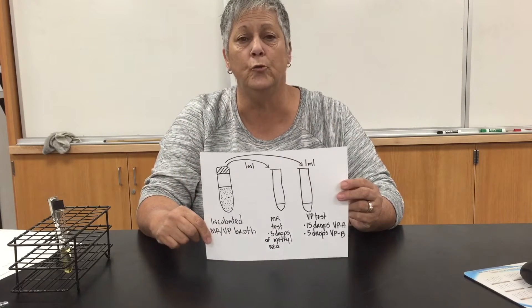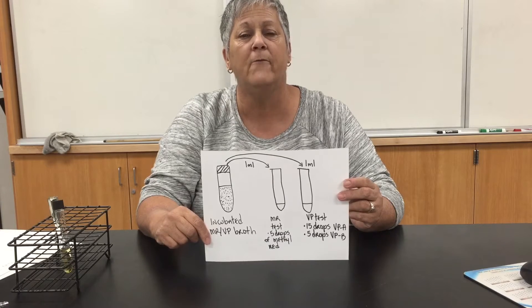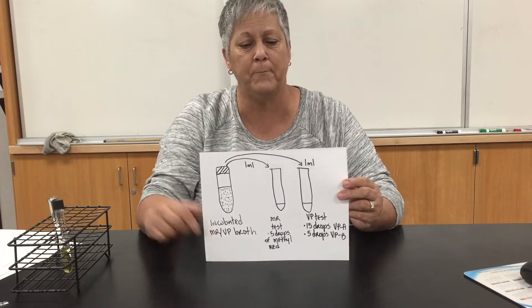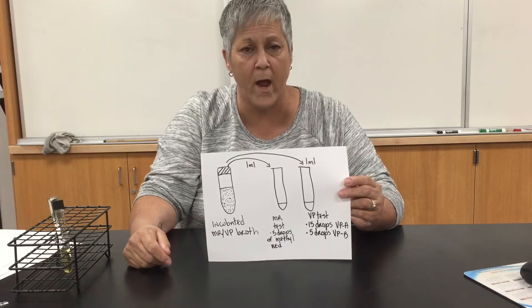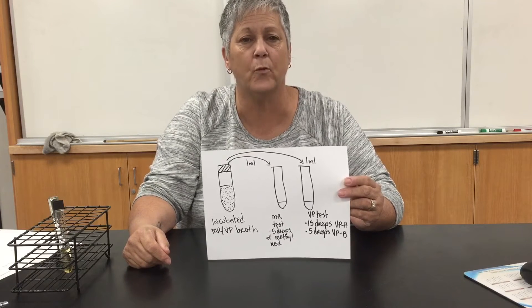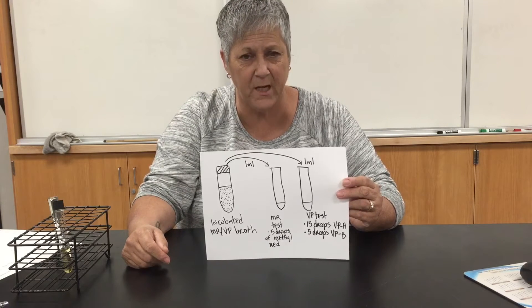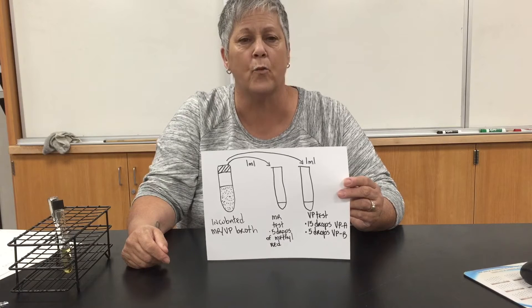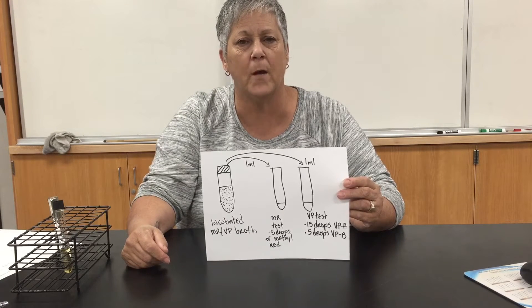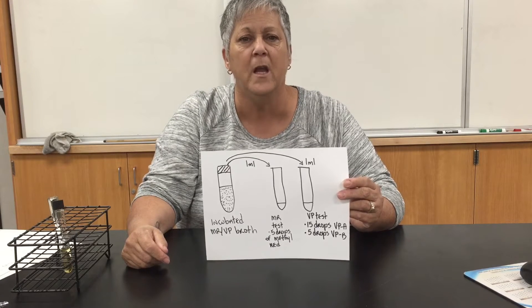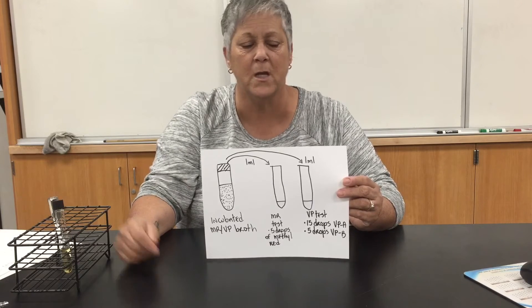To run the MR test, you will add five drops of methyl red to that tube. Methyl red is a pH indicator that is red under acidic conditions. If it remains red after adding, that's a positive test.